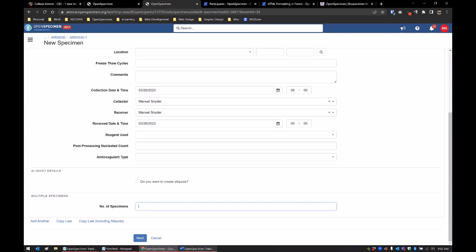Manuel, I have a question for you. Sure. When we go live on OpenSpecimen, will somebody, either super admin like you, or a couple of other people, still have some access to tissue matrix, because we want to make sure that we are not missing anything, or will it be completely gone? It'll be completely gone. Tissue metrics is going offline 5 o'clock on Thursday. Our user license runs out, so we can't have tissue metrics online anymore.